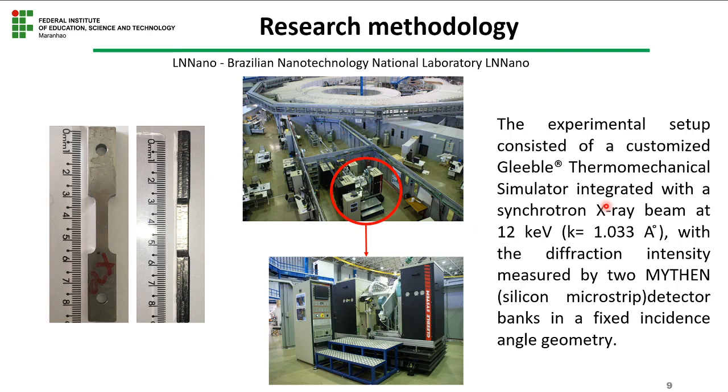So the experimental setup consists of a customized Gleeble thermomechanical simulator integrated with the synchrotron X-ray beam at 12 keV, with the diffraction intensity measured by 2 Mythen silicon microstrip detector banks in a fixed incident angle geometry.